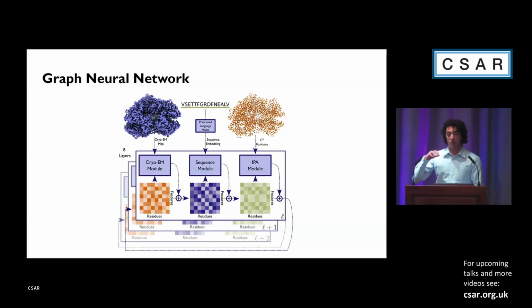And lastly, you have your initial graph. You have a graph neural network, it takes information and puts it in the shared library. And as this shared library gets richer and richer, you're getting more and more information about what your actual full atomic model looks like. And at the end, you can then predict the full atomic model.